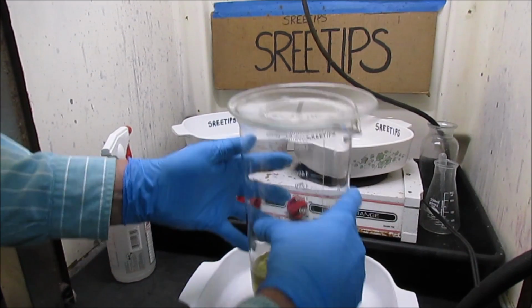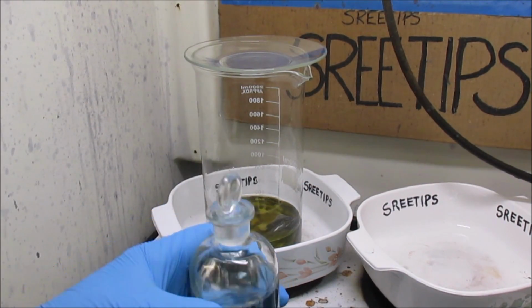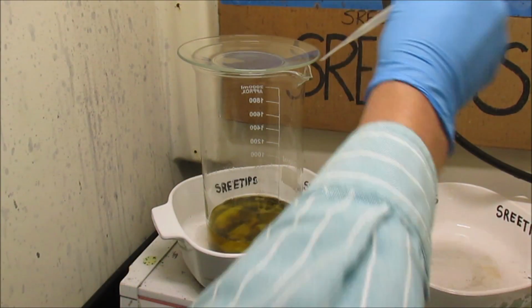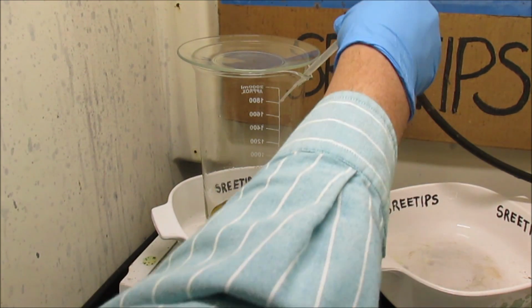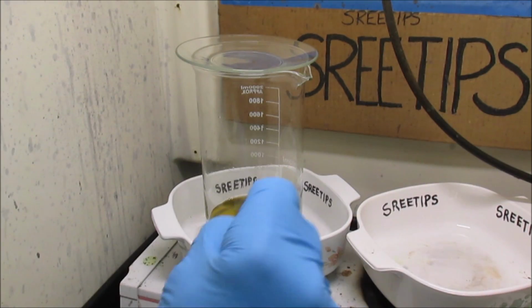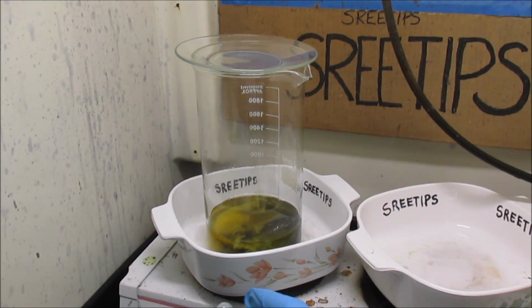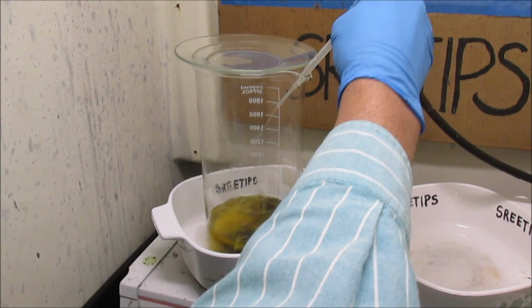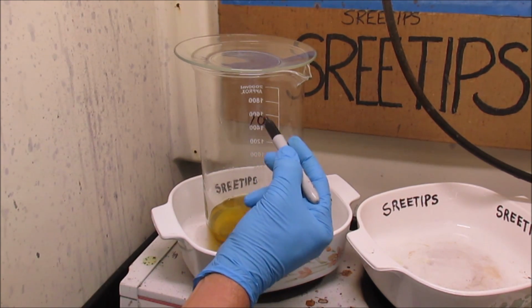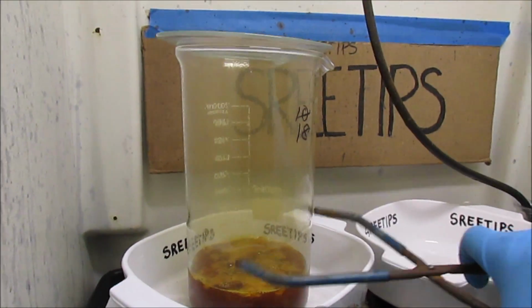Start adding some concentrated nitric to form aqua regia in there. Start adding concentrated nitric now. That's 2, 4, 6, 8, 10. Start out with 10 and see what we get with that. Total of 18 ml of concentrated nitric in there.